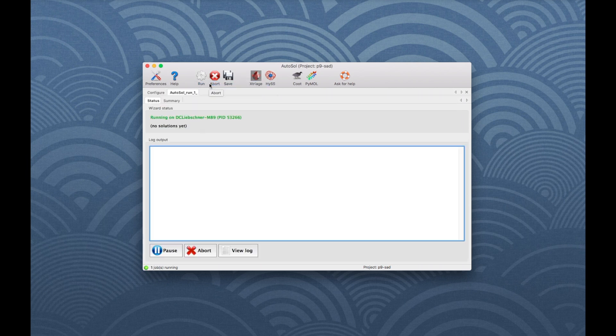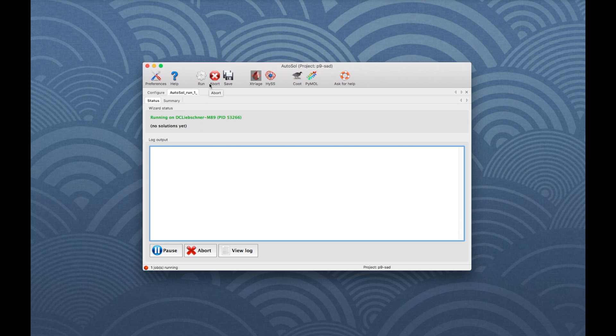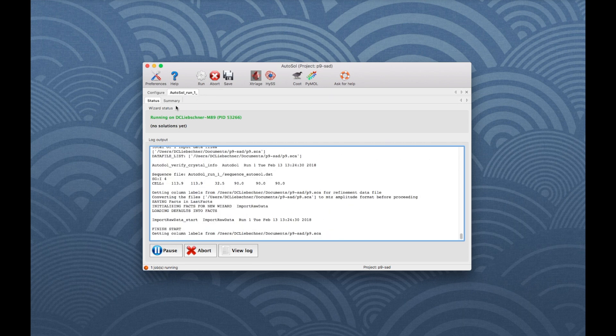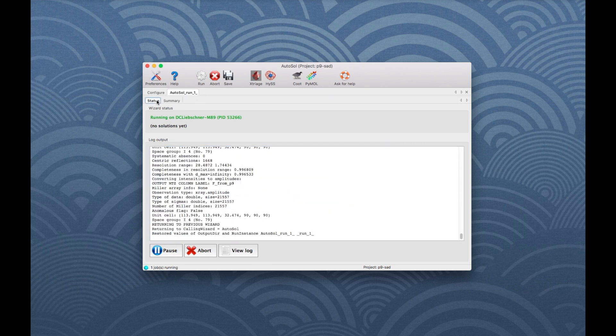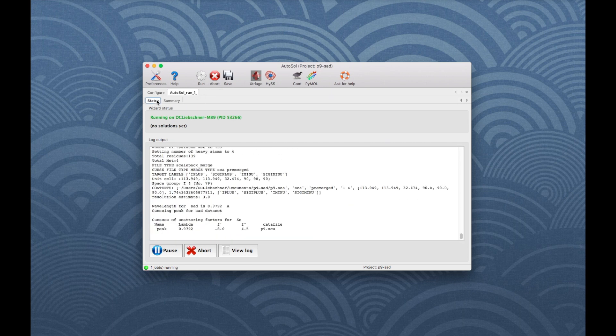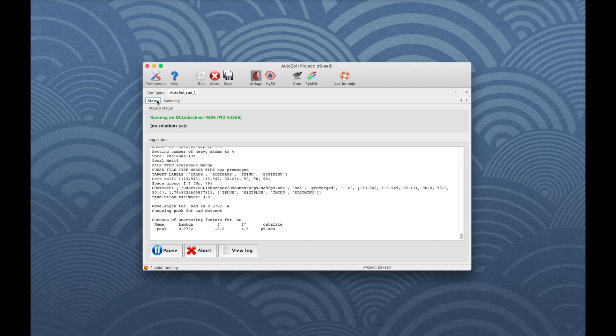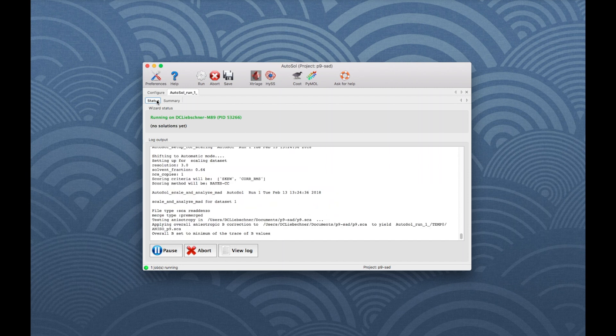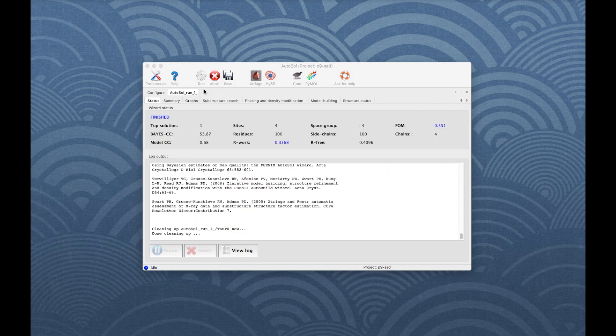A new tab, labeled Run 1, will appear next to the Configure tab. The Status tab on the left shows what is happening now. More tabs will appear while the program is running and they will be constantly updated. Let's have a look through some of the tabs of the finished AutoSol run.